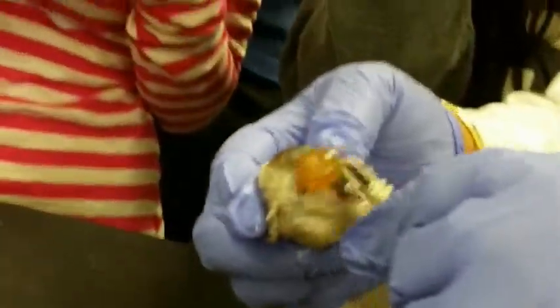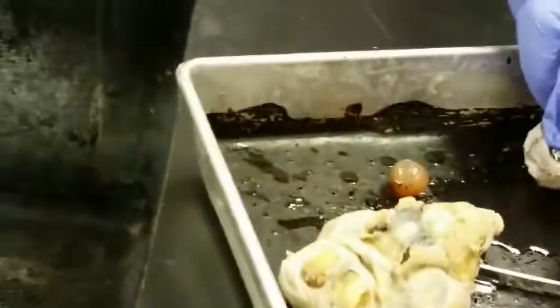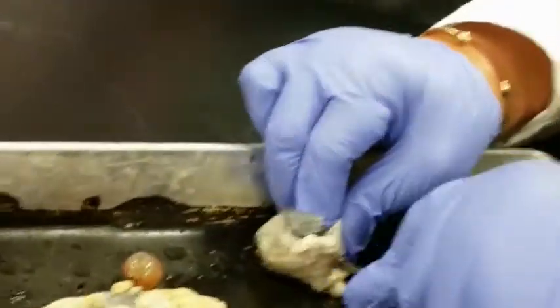And what is this now? Vitreous humor. Is that the lens? This is the lens. Yeah, that's the lens. I think he had a little bit of cataract there.